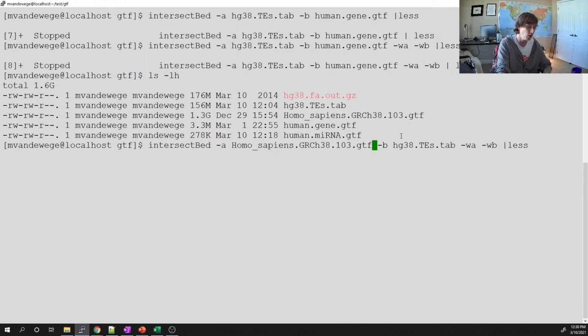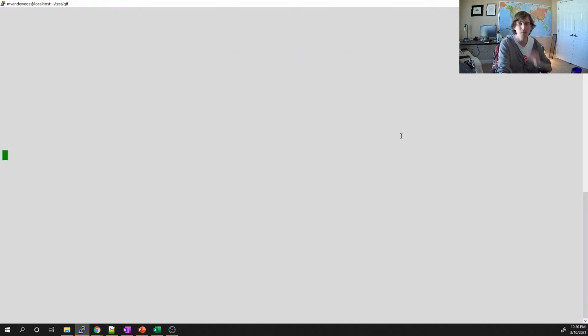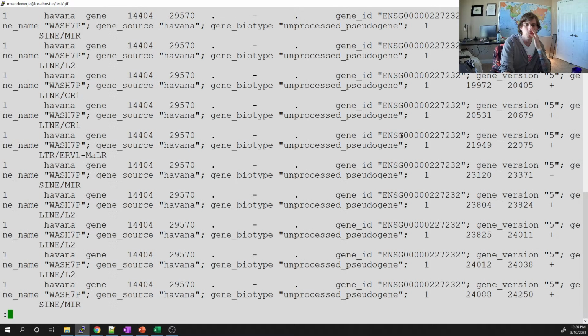And certainly on a small computer, we really don't want to do that at all. It's an easy way to break your computer, to overload your memory. And this will probably take a couple of seconds to actually go because we have 1.3 gigabytes of data to process.